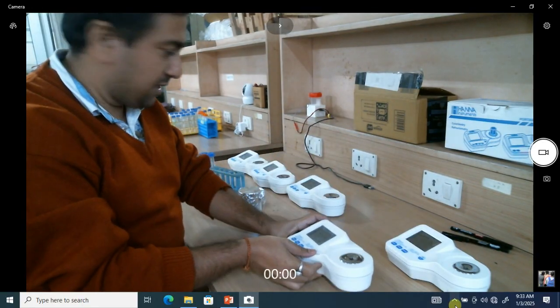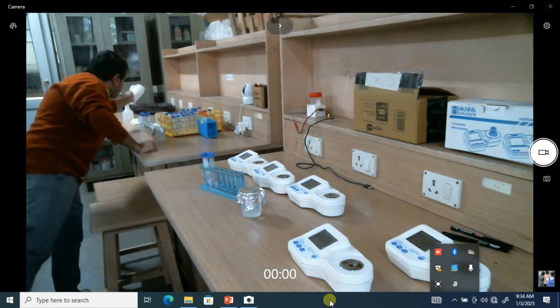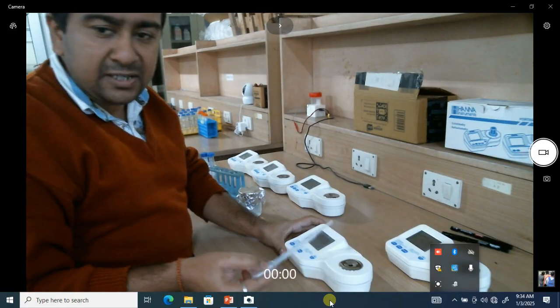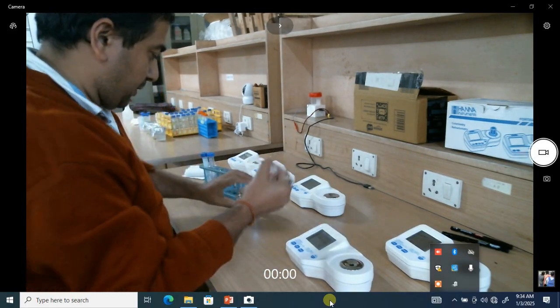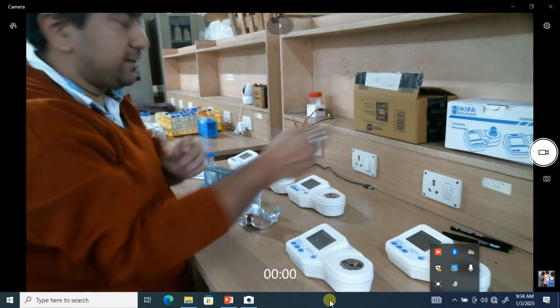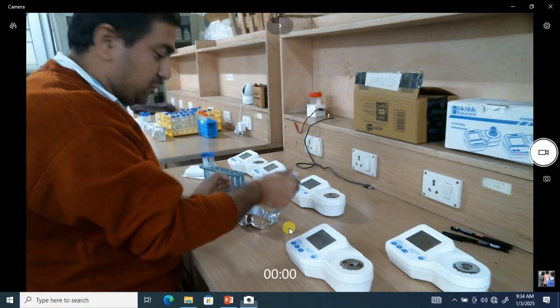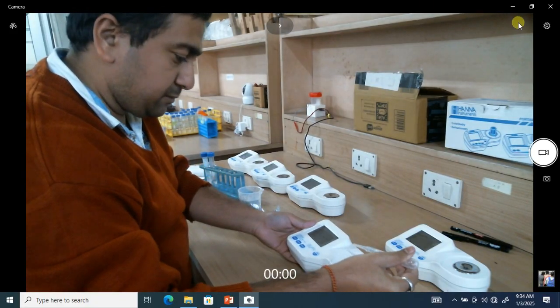Then we will give a drop of distilled water exactly at the center of the prism, so that the sample comes in contact.